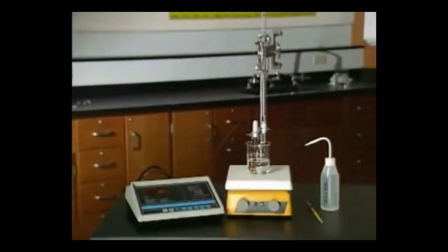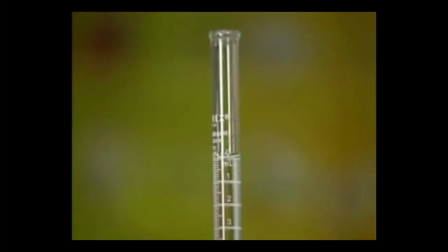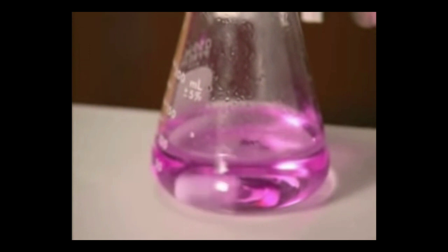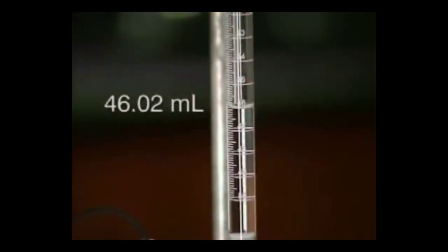A titration is a controlled acid-base neutralization reaction. 20 milliliters of hydrochloric acid of an unknown molarity is added to a flask. 2 drops of indicator dye are added to the acidic solution. This indicator dye is clear in acidic solution and pink in basic solution. The burette is filled with a sodium hydroxide solution of known strength and an initial reading is taken. The base is added to the acidic solution until the solution stays a slightly pink color. At this endpoint, a final reading is taken. The moles of base added equal the moles of acid present.